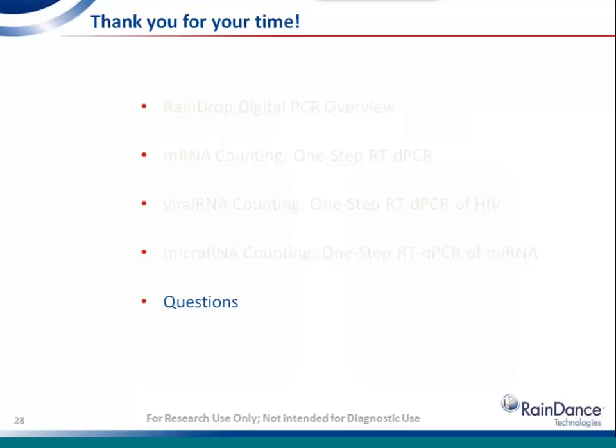I think that this is something for panels of candidate biomarker microRNAs. You're really looking for changes in the ratios between those microRNAs, but there is a lot of power that can be added, both to use potentially messenger RNA as an internal control, but certainly the spike-in exogenous material is useful at a number of levels, including making sure that your RNA purification was efficient. Any material that you spiked into the workflow at the beginning of the process, we can count exactly in the system, and any deviation from what was put into the process can then be used for normalization.